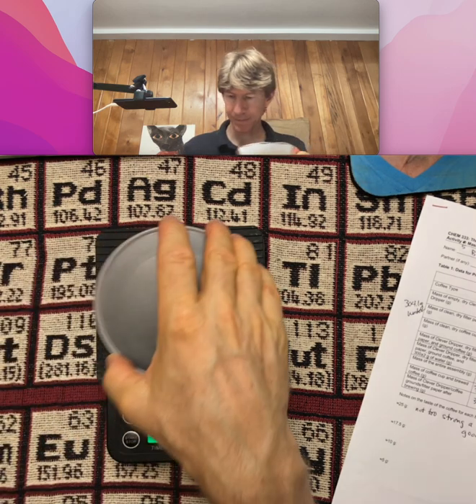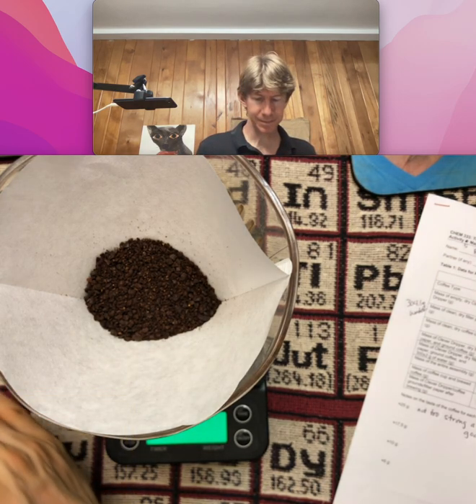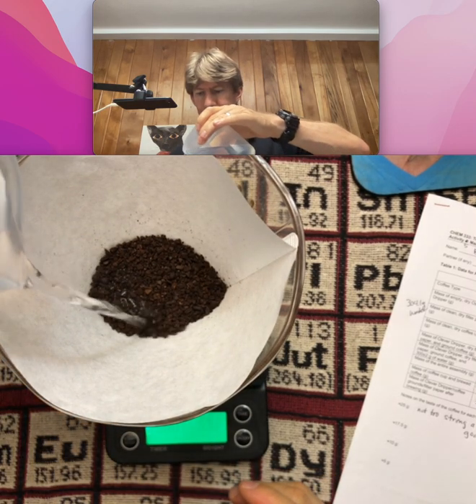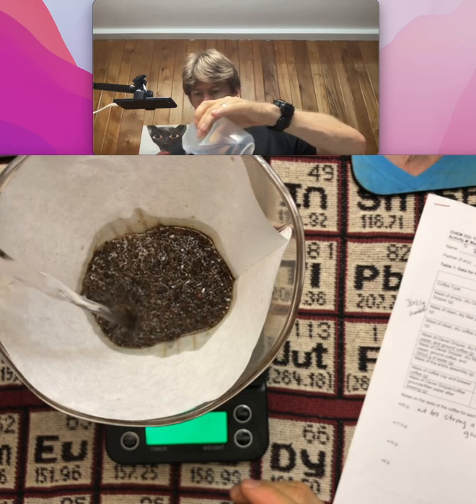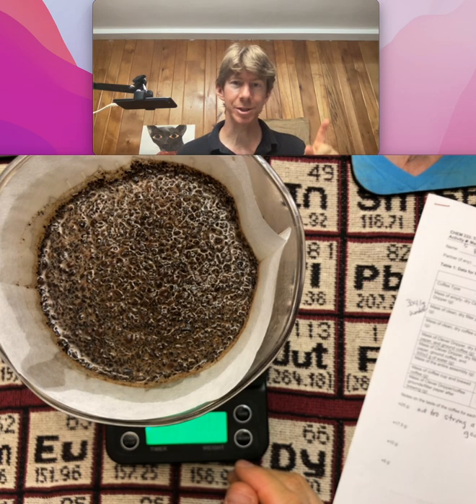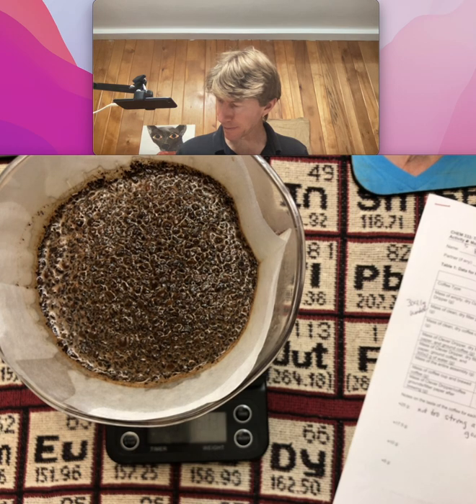Tare it. 300 exactly. So now I'm going to pour this in. I did get a little warm, so I think I would get the pot holders — the hot mitts — if I did it again. This is going to be 603.9 grams.